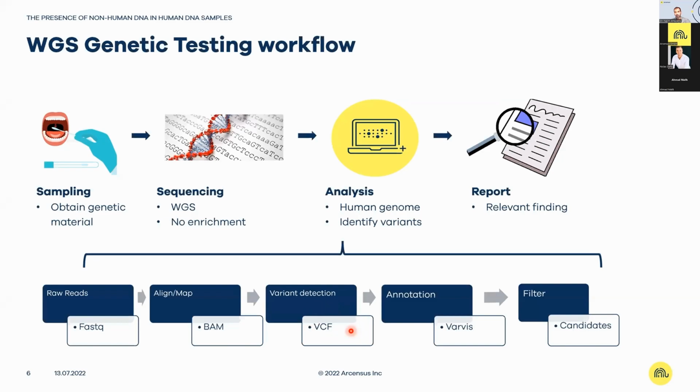And once the variant is identified, then annotation is performed where we try to provide context to the variant. So what does this variant mean? On which chromosome is it present, and what kind of effect does this particular nucleotide change have, for instance, on the protein, if it is affecting a protein, and whether this particular variant has been identified in any of the databases that are available, and whether it is potentially harmful, whether it is associated with disease, and so on and so forth.